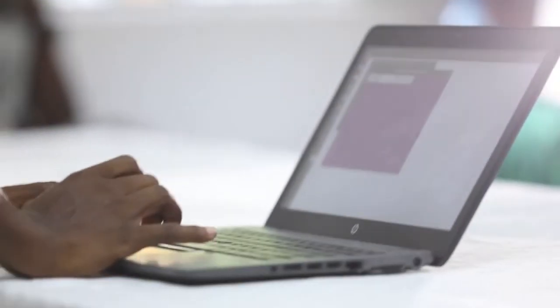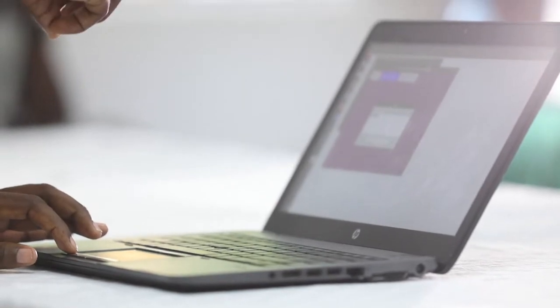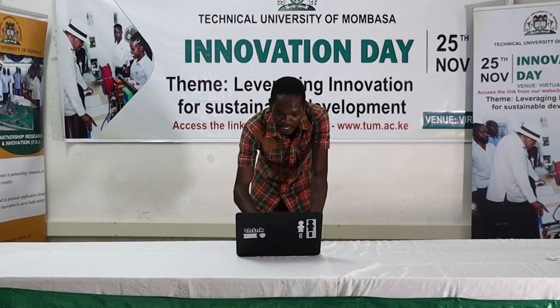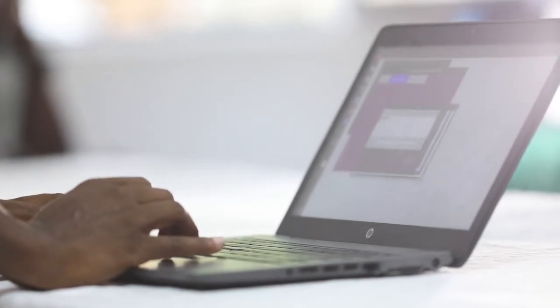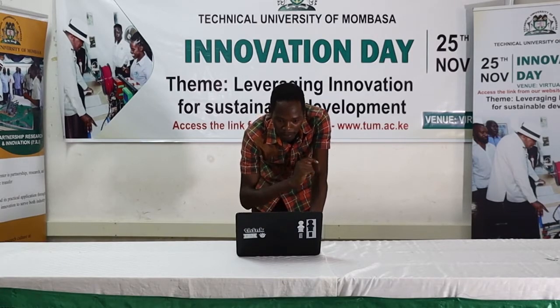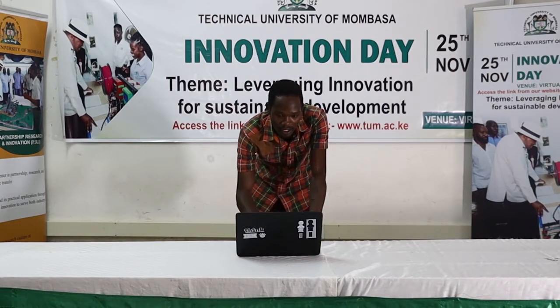So I'm just clicking open folder, and I'm supposed to view those images, because once the images have been taken, they will be saved into different folders depending on the patient details. So I'm just clicking where those images are. Let me just click the first one, because I have a set of images. Let me just choose any image. And then once I load the image, the software is able to detect. And you just have to click a button.